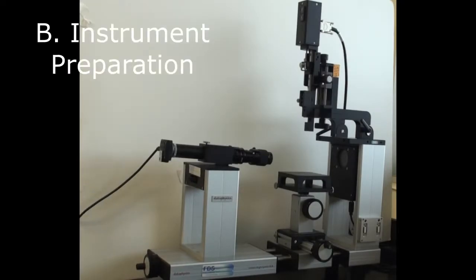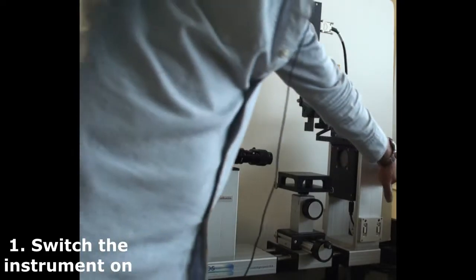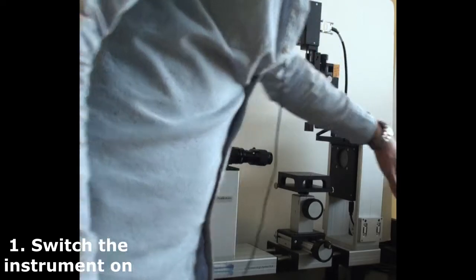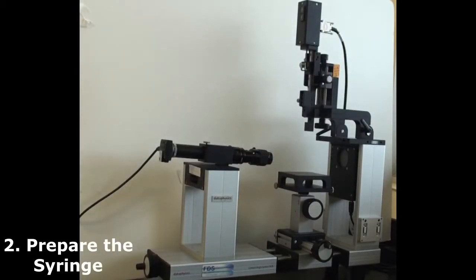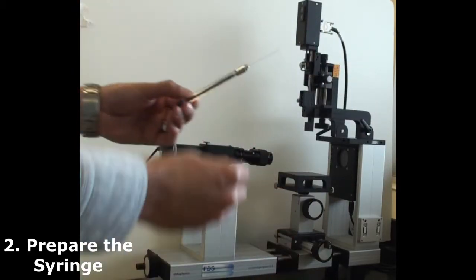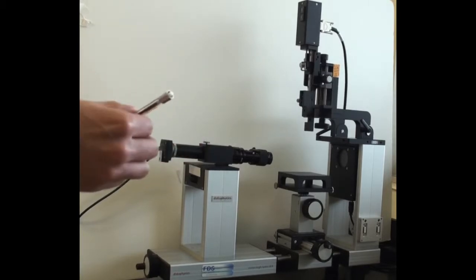To prepare the instrument, first turn on the instrument using the toggle switch on the back, then take your needle and fill it up with your probe liquid.